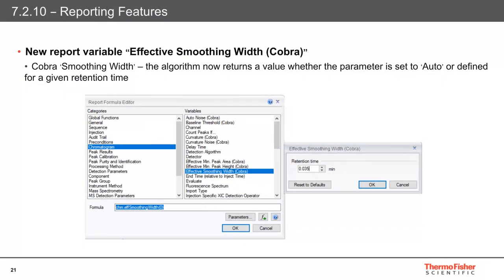When choosing the detection parameter smoothing width equals auto, the Cobra Peak Detection calculates a specific smoothing width value for every single data point in the chromatogram. For greater transparency and record completion, a new report variable called effective smoothing width for Cobra can now report these values.